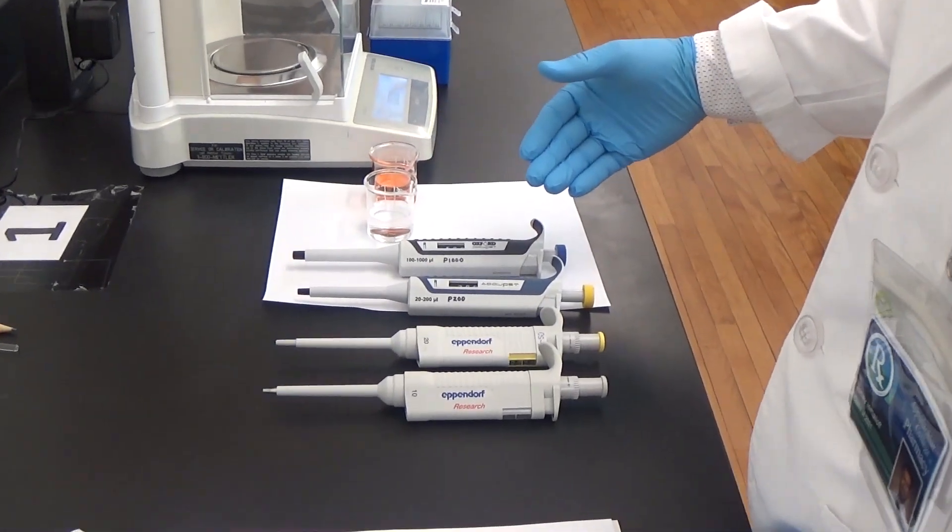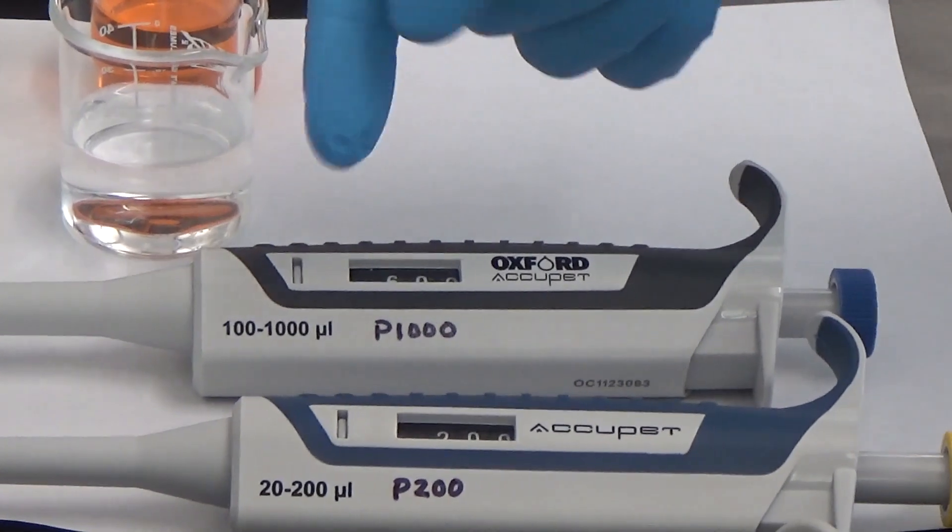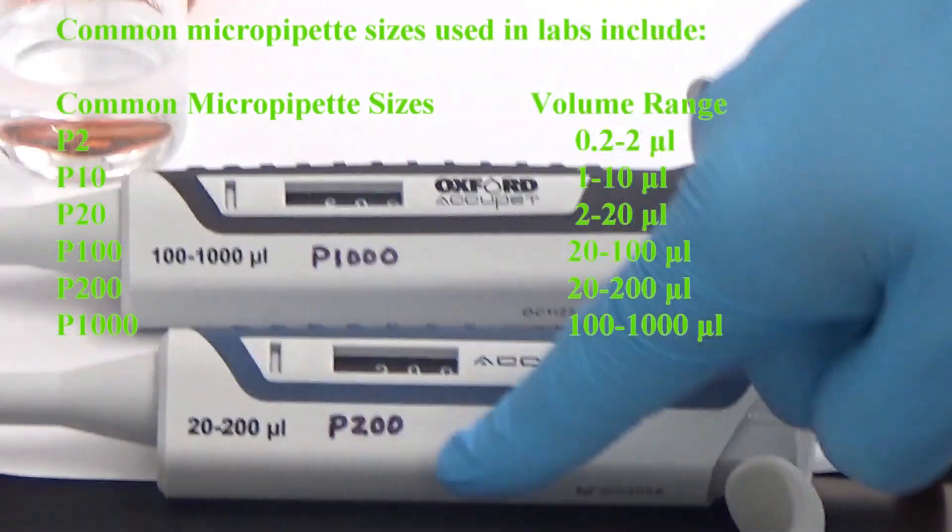Look at the front face of the pipette to see the minimum and maximum operating range. There are different sizes of micropipettes and they are named by the maximum volume they can measure.